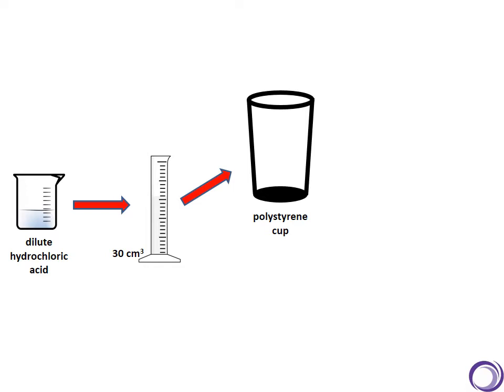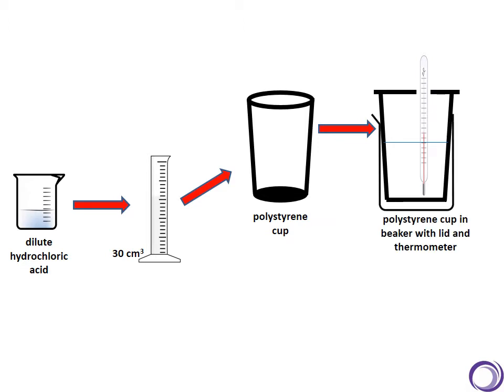Once the hydrochloric acid is in the polystyrene cup, we then add a thermometer and a lid. We must make sure that the thermometer is below the liquid, otherwise it will be measuring the temperature of the air and not of the solution. Polystyrene cups are quite light, so to make sure that it doesn't topple over, we put the whole thing inside a glass beaker.